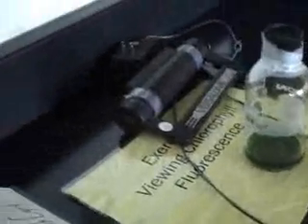Okay. Let's see. Our next demo was a demo of chlorophyll fluorescence. Let's walk over here. Okay, we've got some extracted chlorophyll. So this chlorophyll is not a part of a living leaf anymore. You can see it is, of course, green in color. But it's been separated from a leaf, so it cannot do photosynthesis. However, it's still capable of absorbing some light.